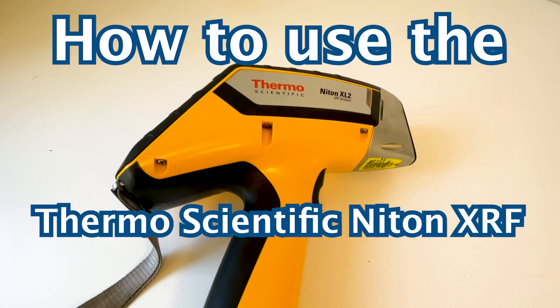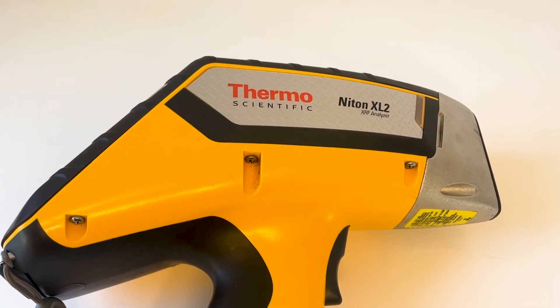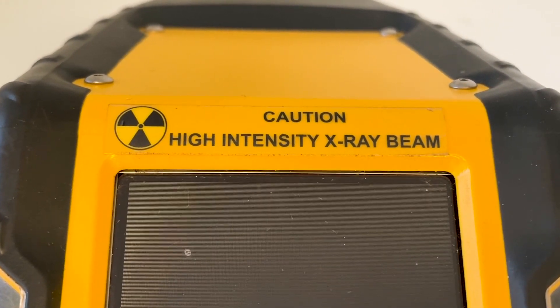How to use the Thermoscientific Niton XRF Precious Metal Tester Model XL2. This highly accurate and reliably fast precious metal tester uses x-ray technology to provide a thorough analysis of gold and other precious metals.